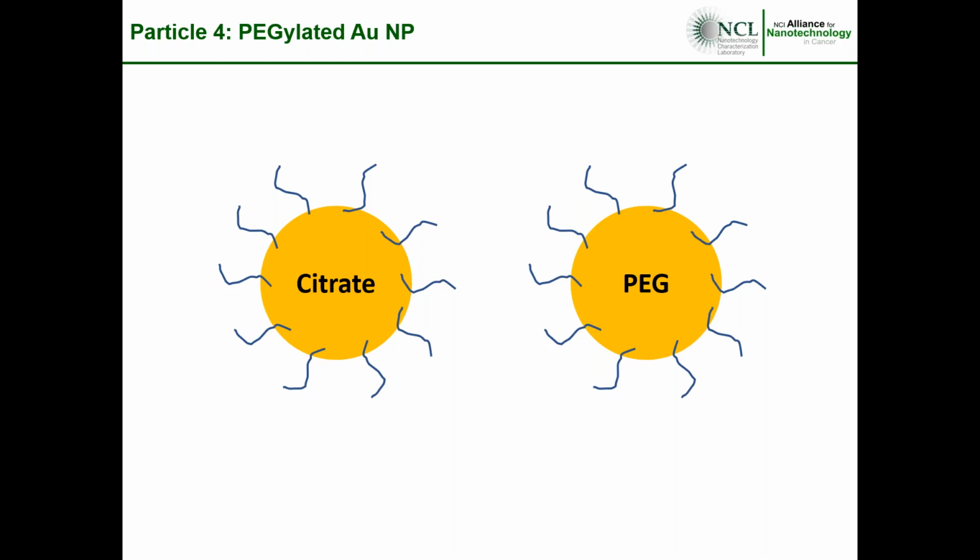So for the single particle analysis, we're going to look at two things. One, we're going to look at concentration determination, and then later on, I'm going to talk about some compositional analysis that we did using it.